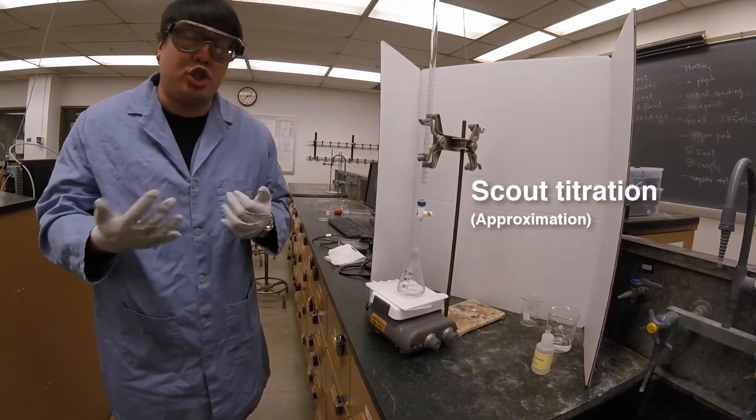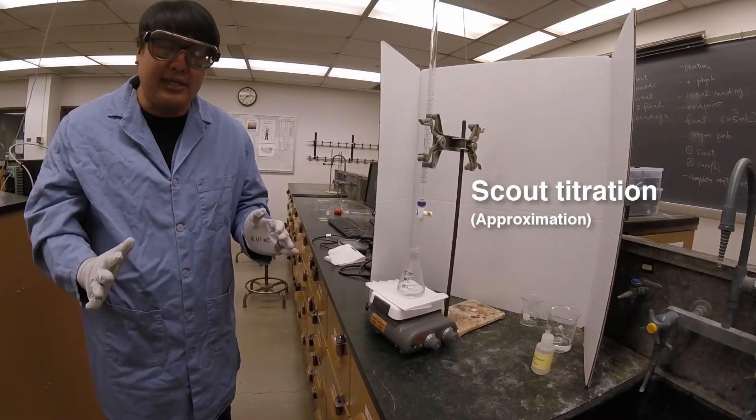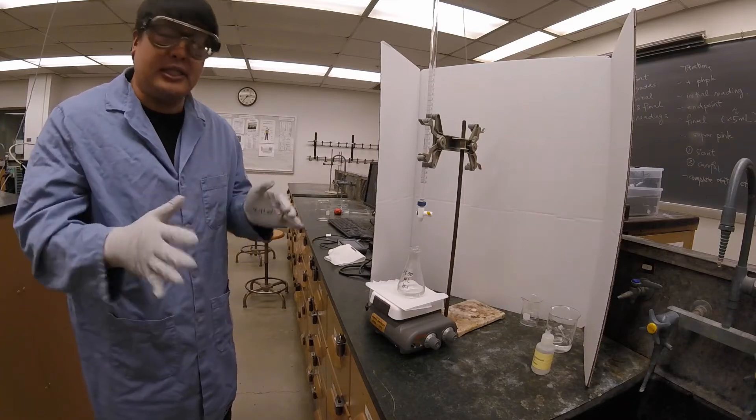The endpoint is when the indicator should change color. The point of this titration is not to be precise — we're just trying to figure out the approximate volume, so this is going to go by kind of quick.